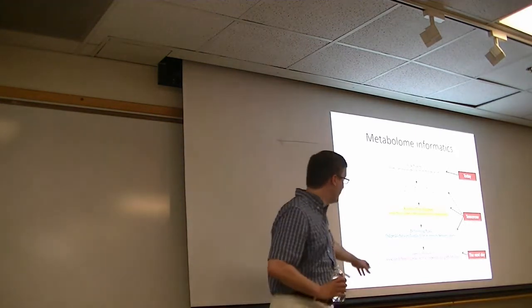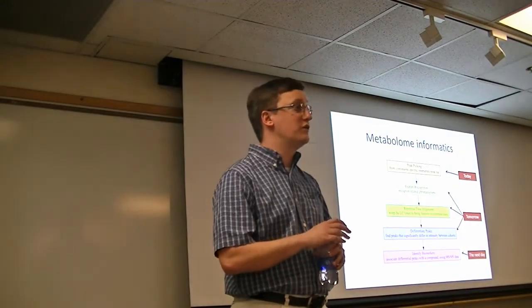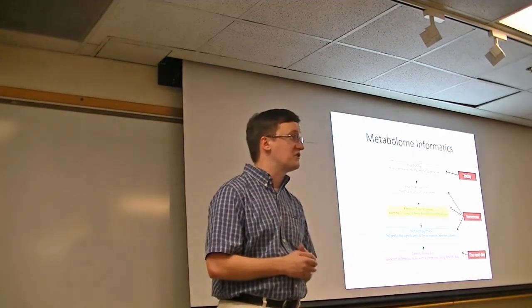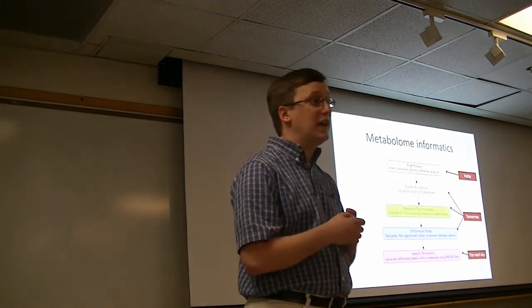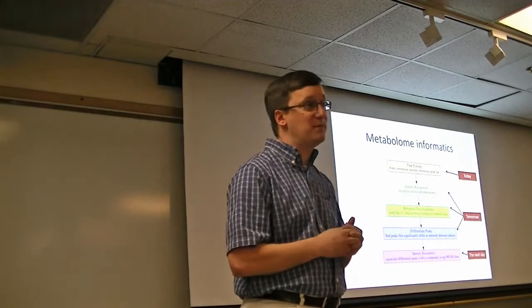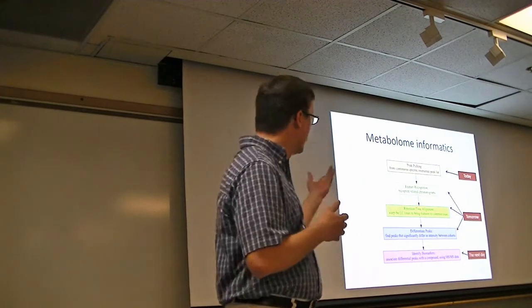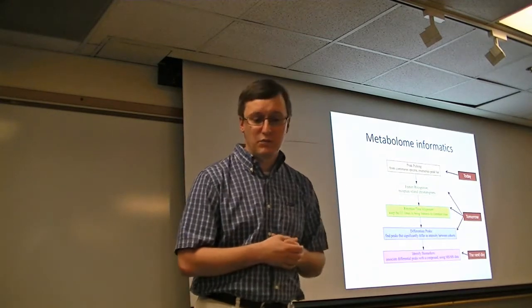And finally, on the third day, we'll be talking about the identification of unknowns. So when we have tandem mass spectra, what can we do to make sense of them? We'll be talking about two different database resources that are out there called Metlin and MassBank. And we'll also be looking at some algorithms designed to identify metabolite species directly from tandem mass spectra. And for that, we'll be talking about a new algorithm that my graduate student, Michael Koshin, has put together called Breezy. So we'll be working through all of those examples as we move ahead.